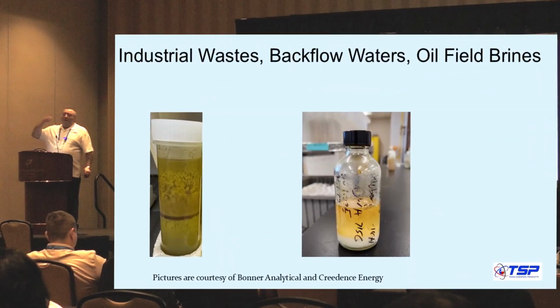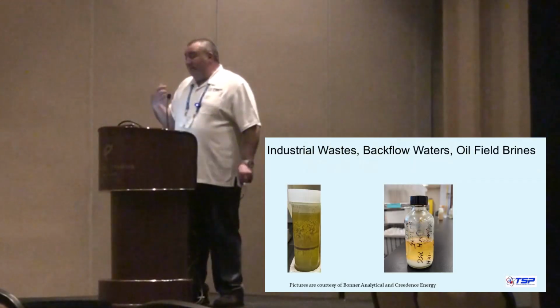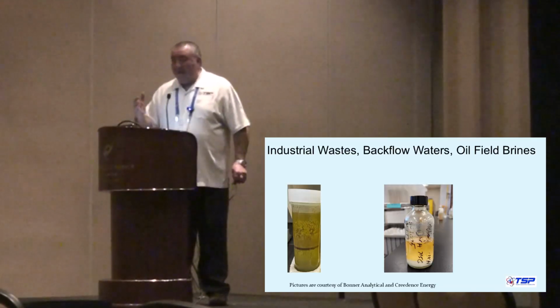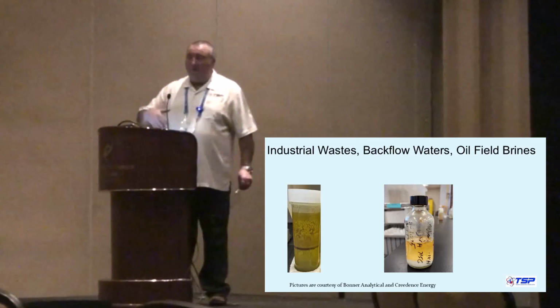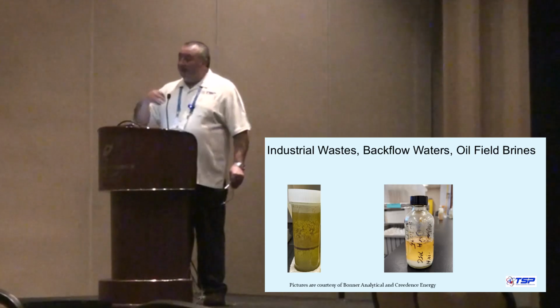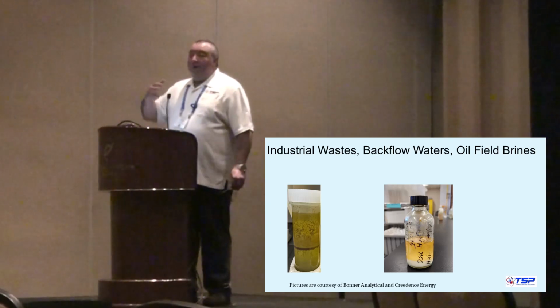So when you run clean samples, there is nothing wrong with a concentric nebulizer. And my suggestion is, if you don't have to clean it every day, then it's fine. There is nothing wrong with it. So clean samples, also self-aspiration. Concentric nebulizers self-aspirate.